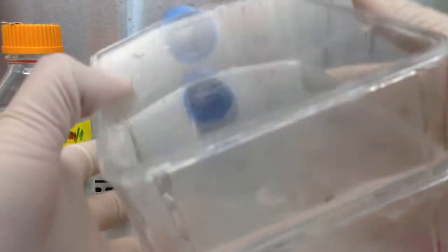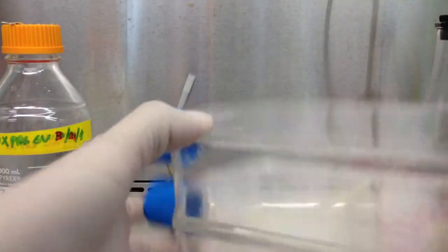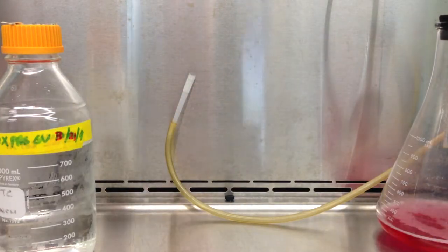And then try to evenly spread it out. So what you'd like to do is go to one corner, spread it to the other, go to the other corner and spread it over. And you can actually see, the quality of the video won't be good enough to see it, but you'll see a film going over the cell layer. And then just incubate for about 2 to 3 minutes.